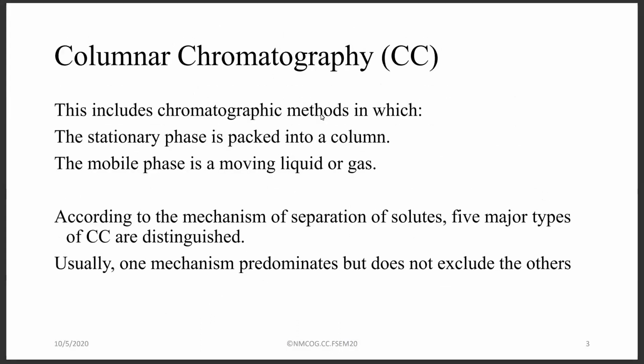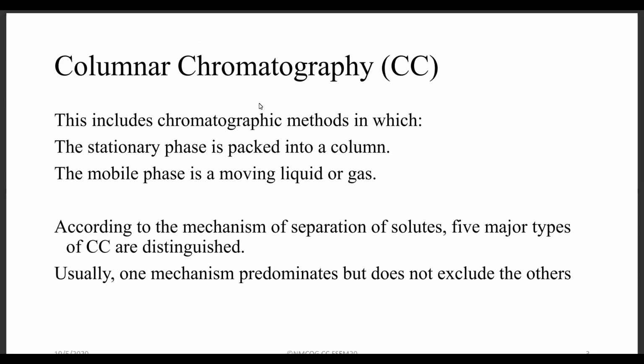So, columnar chromatography. This mainly includes a stationary phase and a mobile phase, whereby our stationary phase is packed within a column and the mobile phase is a moving liquid or gas.